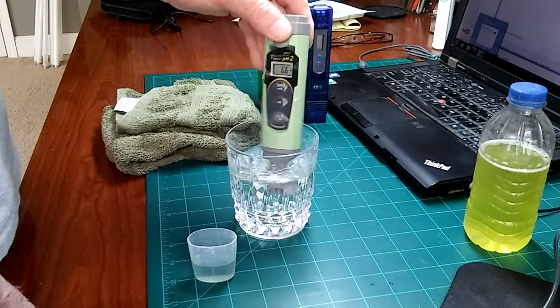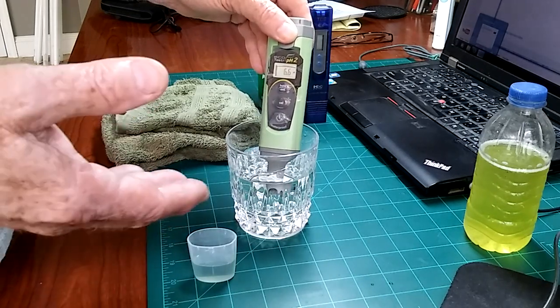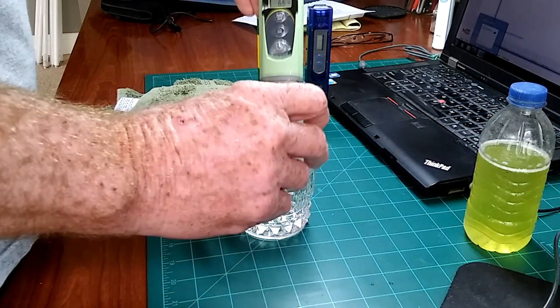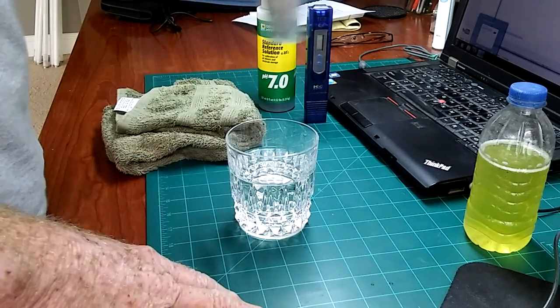It's getting calibration fluid in it — that's what's causing it to go up. You should always rinse this off before you put it back in the cap. If you don't, you'll cross-contaminate — just like this. You'll cross-contaminate.